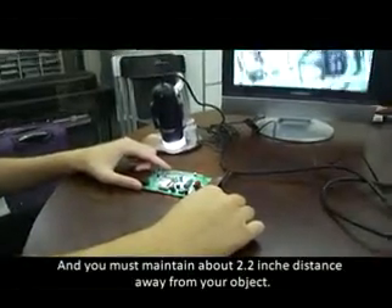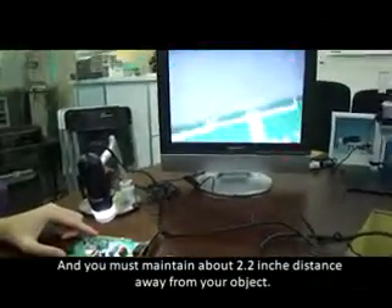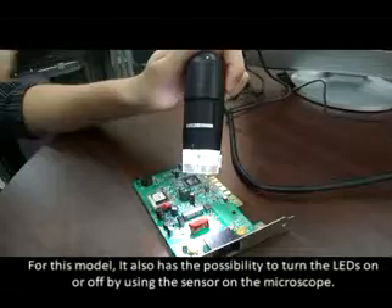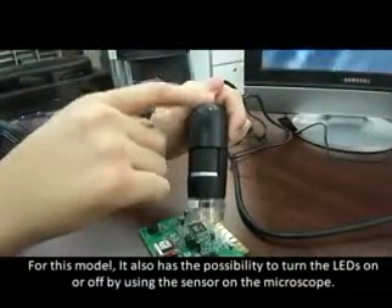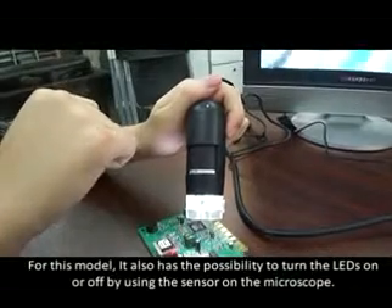For this model, it also has the possibility to turn the LEDs on or off by using the sensor on the microscope.